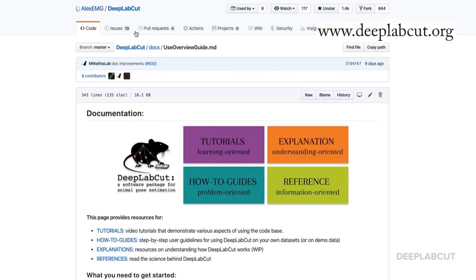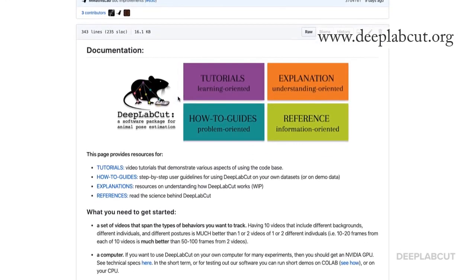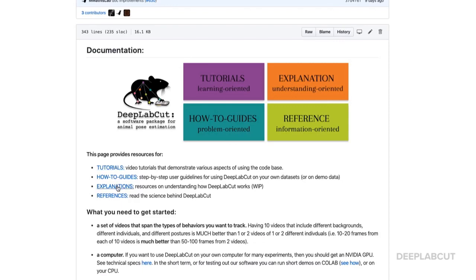For example, if you click on Getting Started, it takes you to our GitHub repo, where you can see the overview of the documentation. This is generally broken into four parts: video tutorials, how-to guides, explanations, and references.